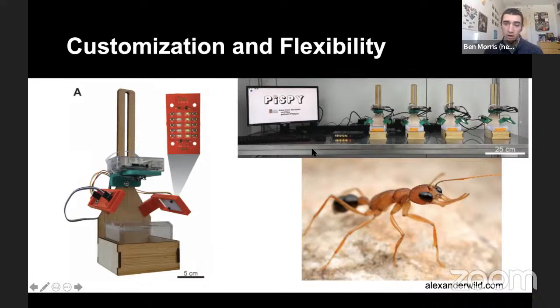And so in our lab now, we've downscaled a little from the 16 PiSpys that Greg had going at Bucknell. We're now down to 4, with 4 different colonies being imaged. But again, using the KVM switch is a really easy way to have multiple colonies, multiple PiSpys going at the same time with only having to use one monitor.